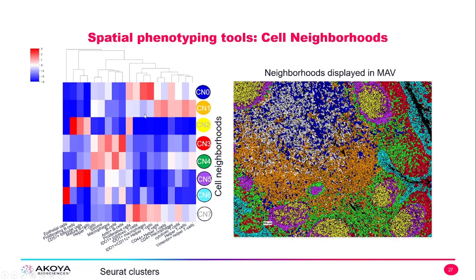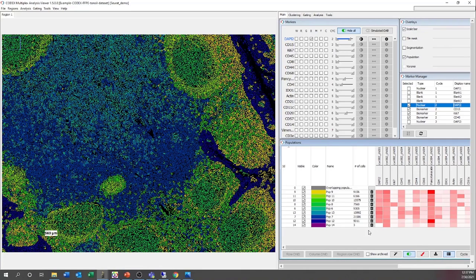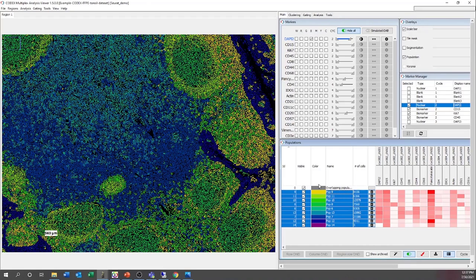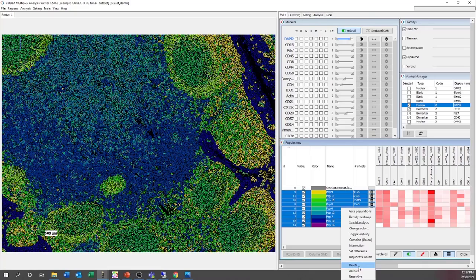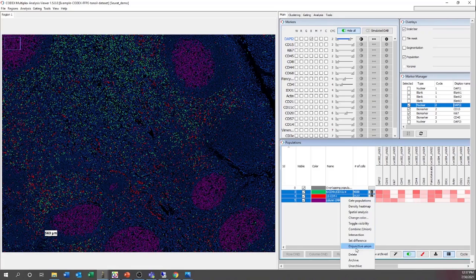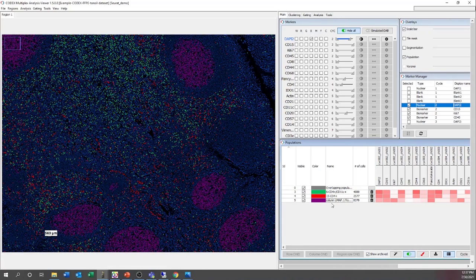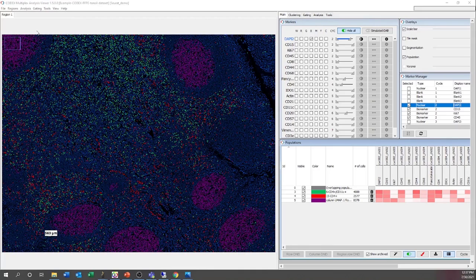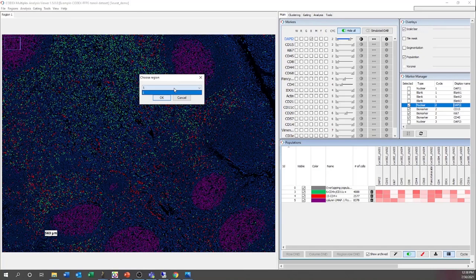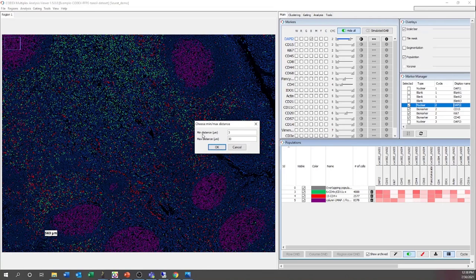If we wanted to look at pairwise relationships, we come back to CODEX MAV, recover the archived populations, and calculate some spatial relationships. We can choose Region 1 for the analysis and a minimum distance of 3 and a max distance of 30 microns for this study. We could choose a different max distance, but 30 is a good basis for the spatial calculations.